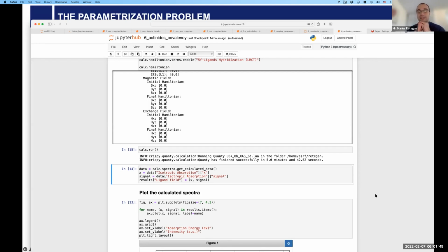Actually, this is very useful, because essentially we analyze one set of spectra and then we look at the output, which is more or less Python, and then we say, okay, we have this parameter set, and then we just copy in the other file names and give it a go. Okay, yes.